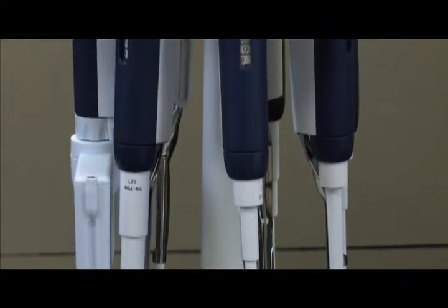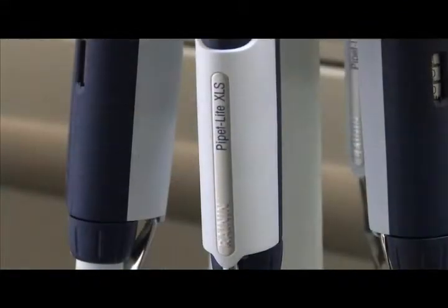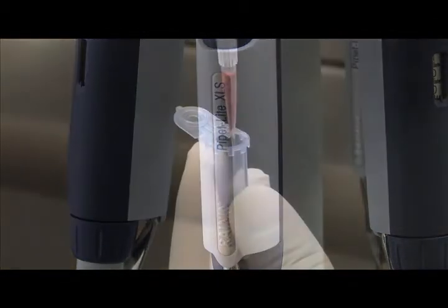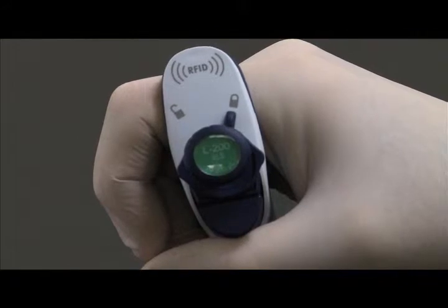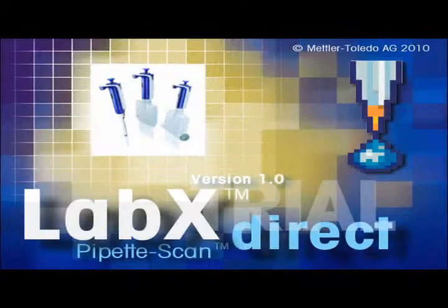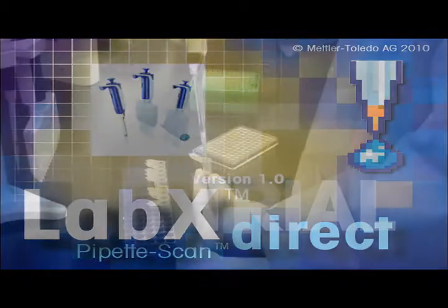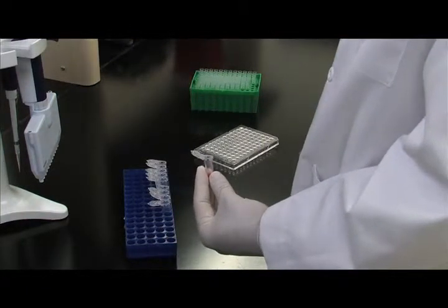For a more comprehensive solution to pipette calibration management, look no further than Raynin's Pipette Lite XLS. It's the world's first pipette equipped with RFID technology. And with Raynin's RFID Reader and LabX Direct Pipette Scan software, you have everything you need to transform how your lab manages pipette calibration and compliance.